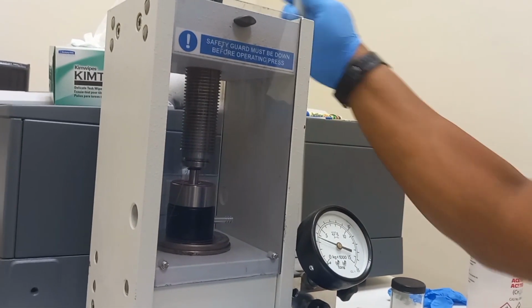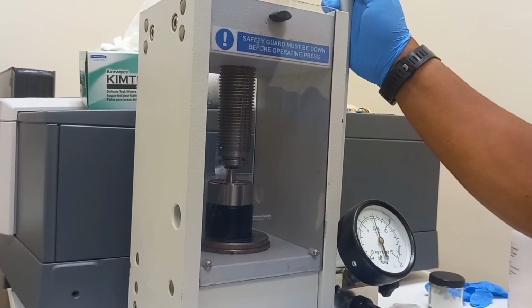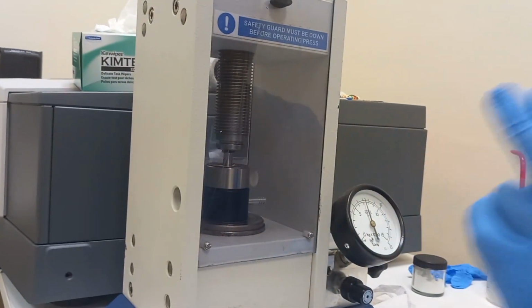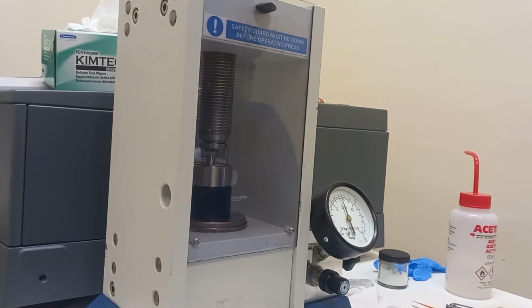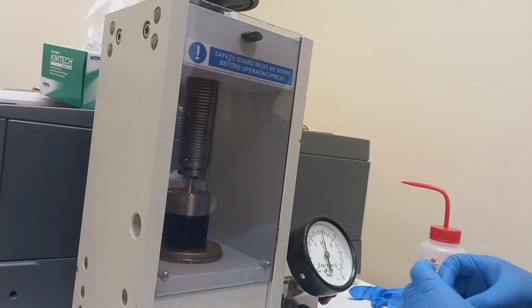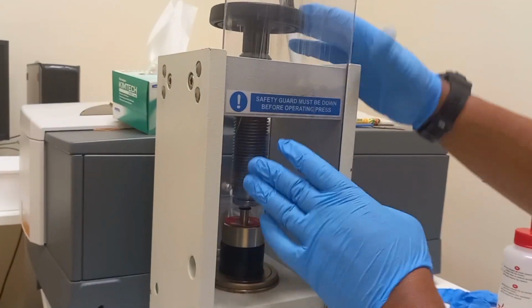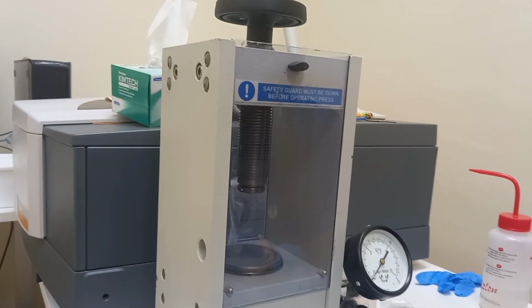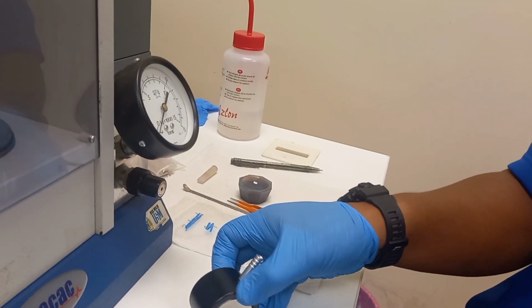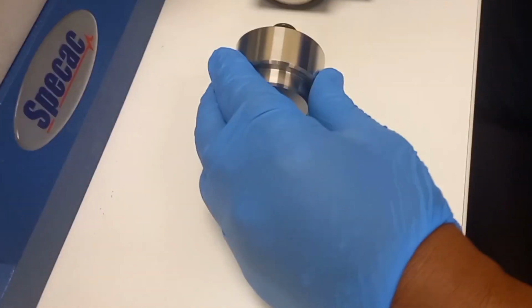Once the pellet is prepared, we are ready to keep the sample in the FTIR spectroscopy. After 2 minutes, release the pressure and remove the sample mount from the hydraulic press and then remove the sample. Since it is a little bit hard, give some hammering in order to remove the sample from the mount.